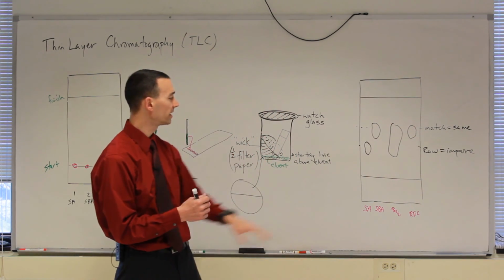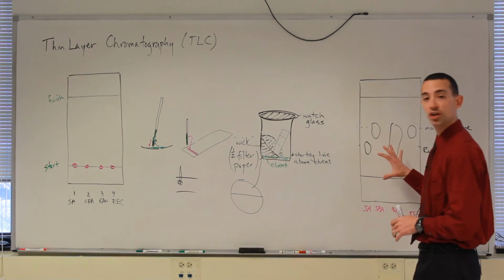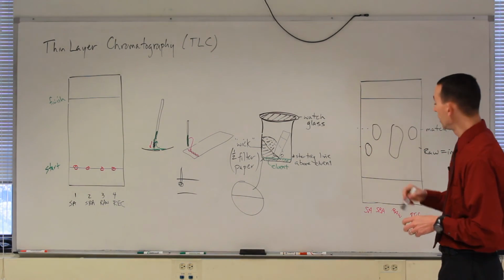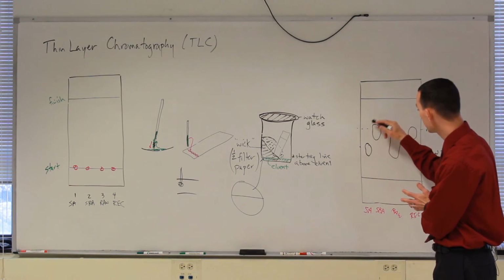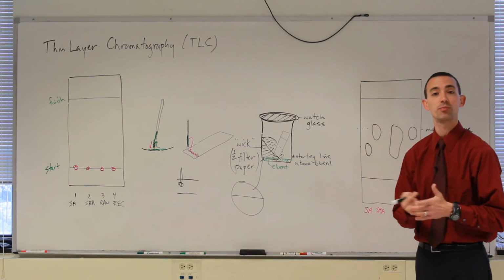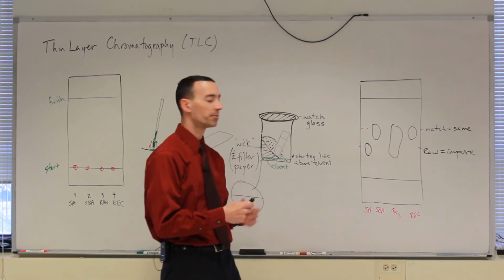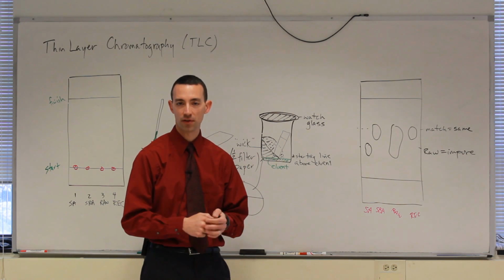Okay? Again, just like with the iron 3 chloride test, it might be great to take a picture of your TLC plate. Taking a picture would be a great idea, or while it's under the UV light, circling the spots, all right, so that you could draw a sketch of this as part of your formal lab report. Again, visual evidence that you could convey to your instructor to back up the claims that you will be making about your sample of aspirin.